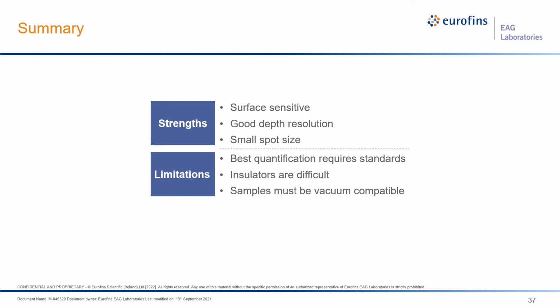But having said that, I am of the opinion that it is possible to obtain an Auger spectrum from everything, but you have to give up some of the advantages of the technique to do so, like giving up spot size or using lower energies, which will lower your detection limits for Auger peaks of higher energies. It may also require a thin metal coating to make it slightly conductive, which will compromise your surface sensitivity.